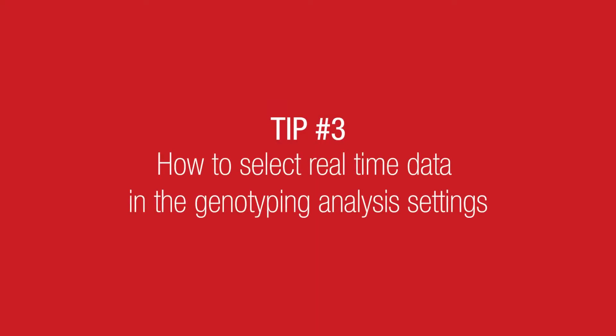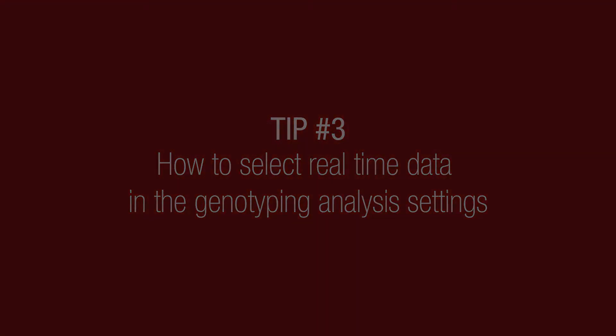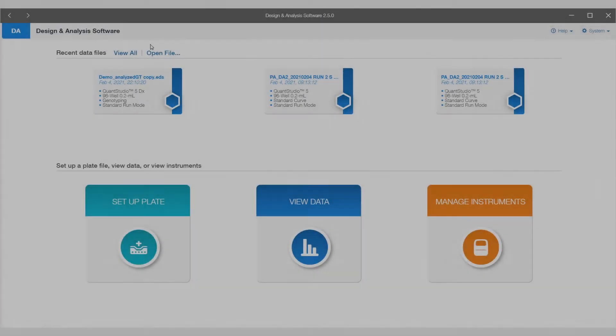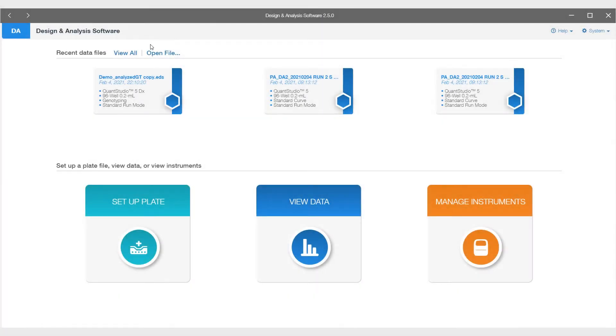Tip number three, how to select real-time data in the genotyping analysis settings. Once your experiment is complete, it is time to analyze the data.